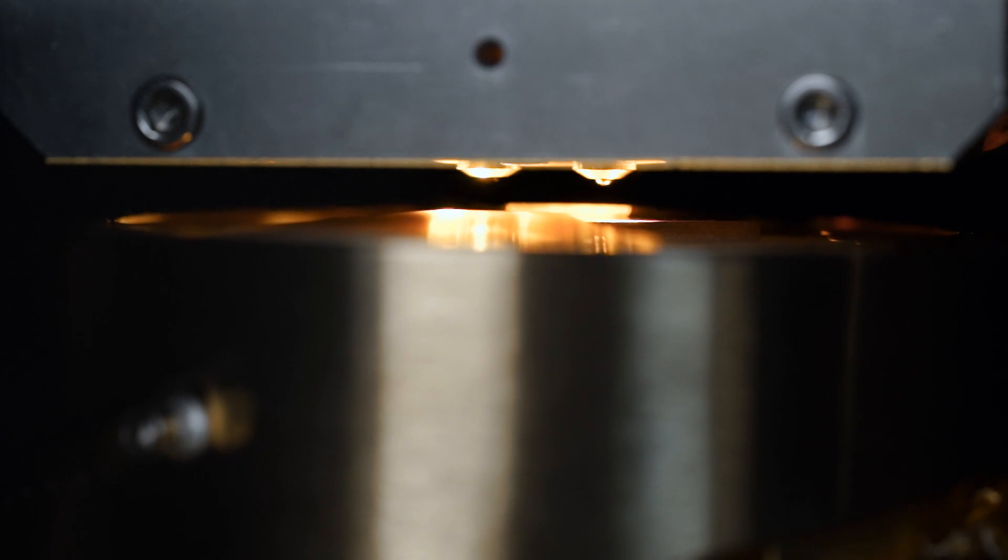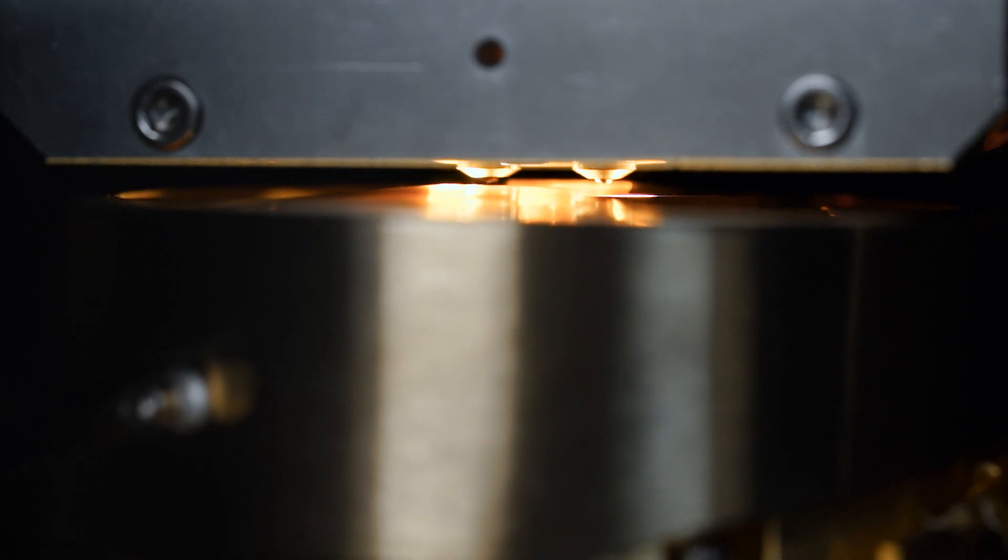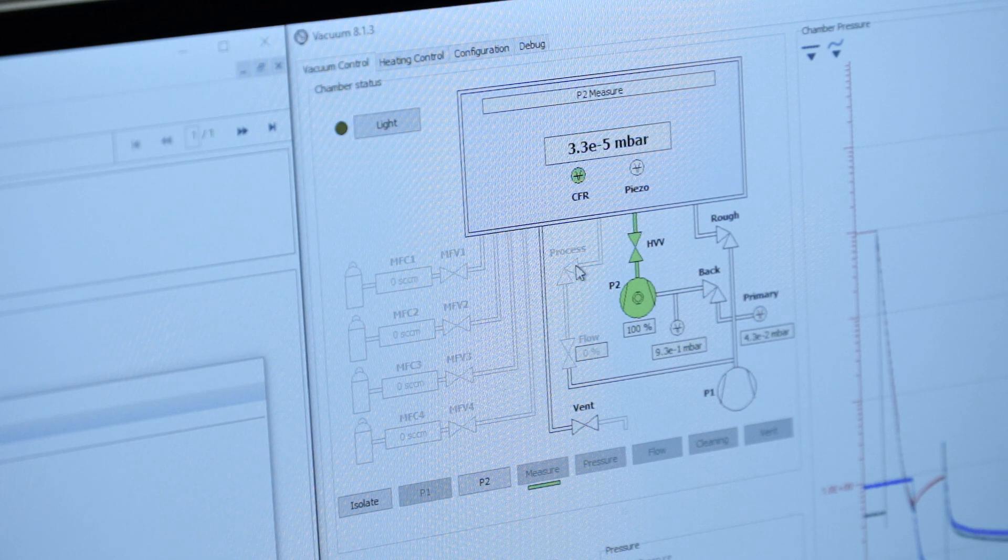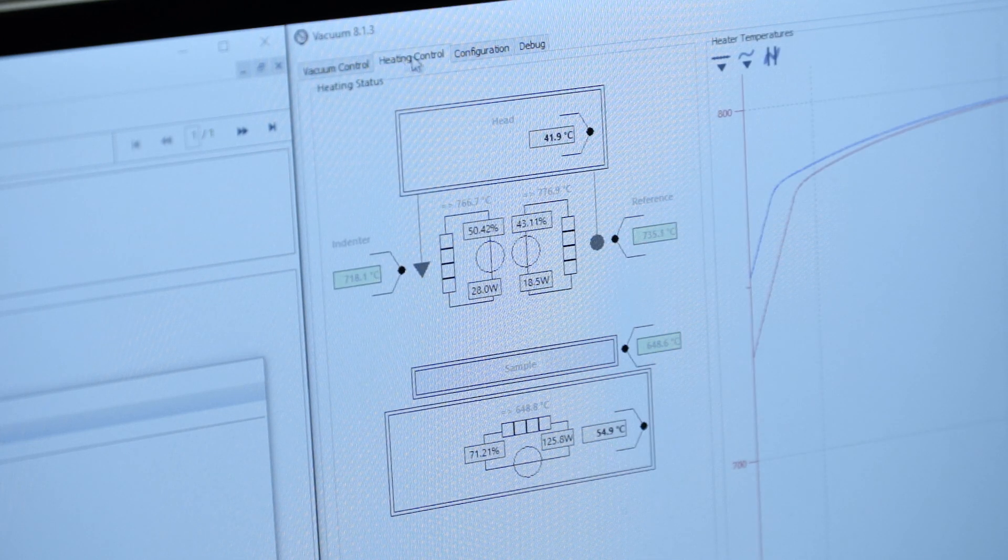The software automatically controls the approach and thermal stabilization of the sample and indenter tip, as well as the temperature and vacuum in the chamber.